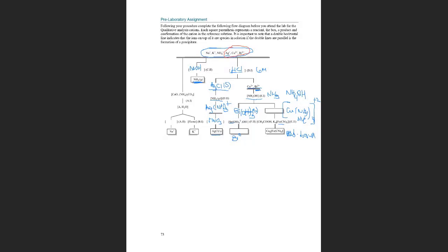And for the sodium and the potassium, what did we do? In both, we did a flame. You remember that the sodium gives you a yellow flame and the potassium gives you a lavender flame.